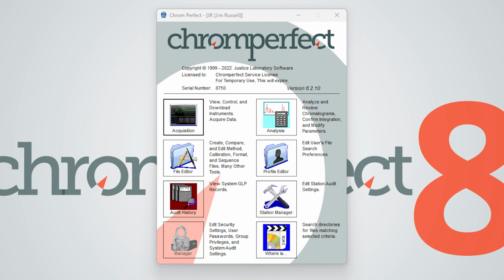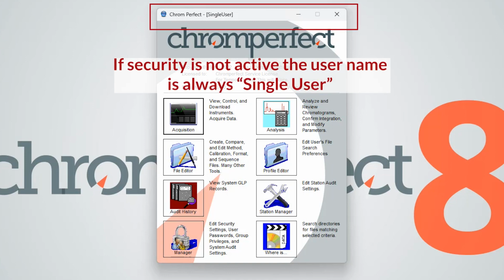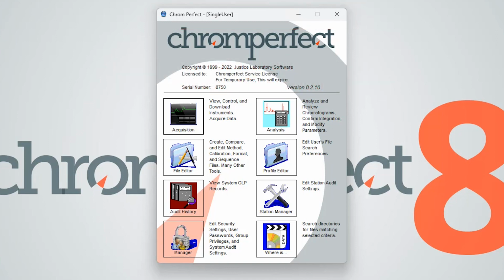When the main menu is launched, the following form appears. If passwords are enabled, then the menu form's caption, the ribbon along the top edge of the form, contains the user's logon name and the user's full name. If passwords are disabled, then the menu form's caption looks like this. The user's name is displayed prominently because, as described above, this user will own any programs launched by pressing buttons on this menu. Further down the form, above the buttons, appears certain information about this Chromperfect installation.